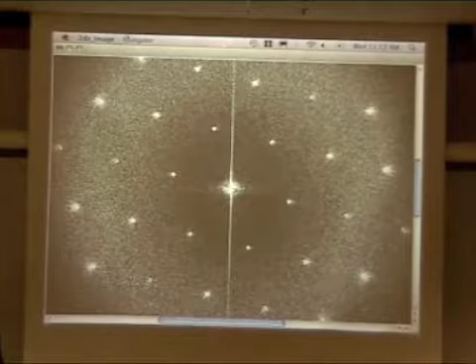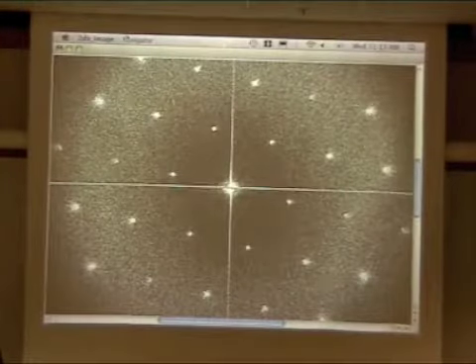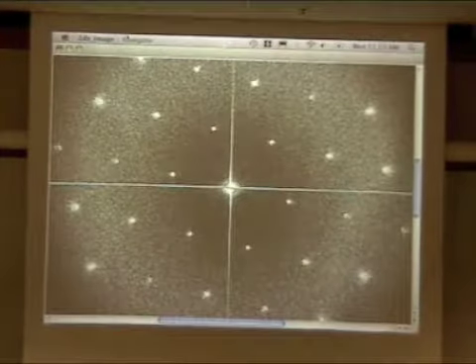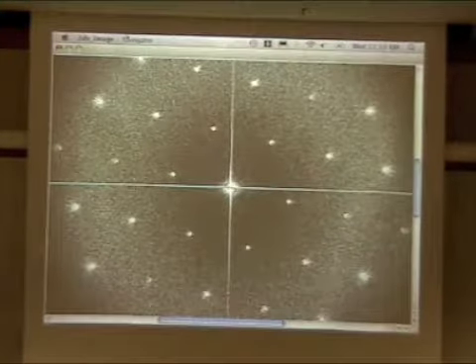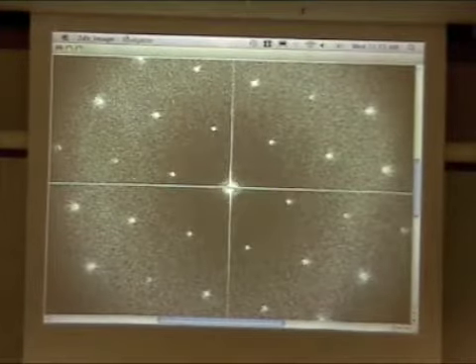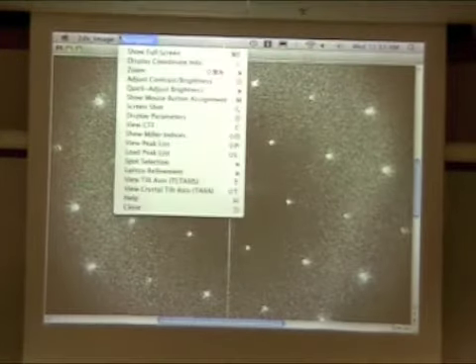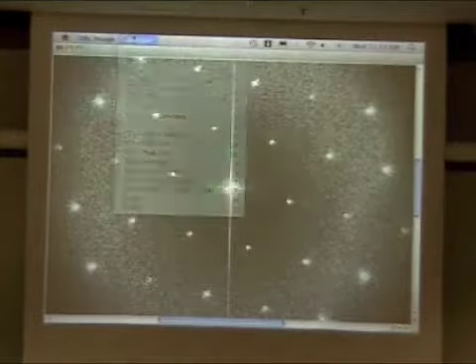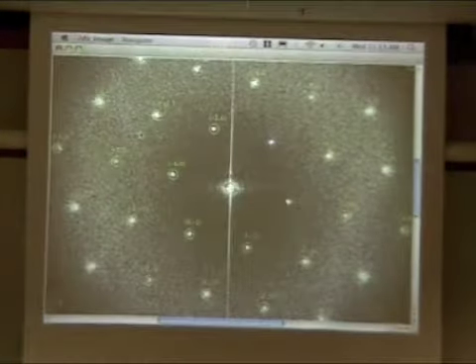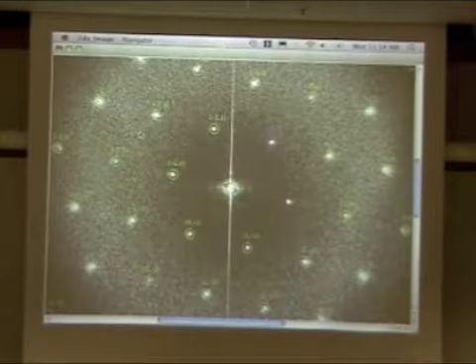One thing, for instance, we've recently added is there's a tilt indicator. Obviously, this isn't too interesting because there's a default 0 tilt, but you can actually see the tilt axis in both Fourier space and real space in all of these images. For instance, in addition, you could show your lattice and view Miller indices. It's another thing that doesn't show up too much. I mean, some people don't know about this.